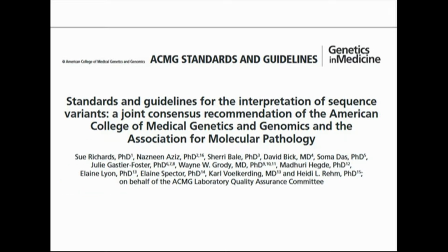And so this is a paper that many of you are familiar with, I imagine: the ACMG standards for interpreting a variant of your own that hasn't been seen before. It guides you through the best practices, and it's used all over the world, even though it came out of an American effort, the ACMG.